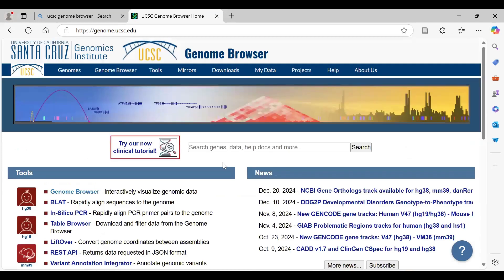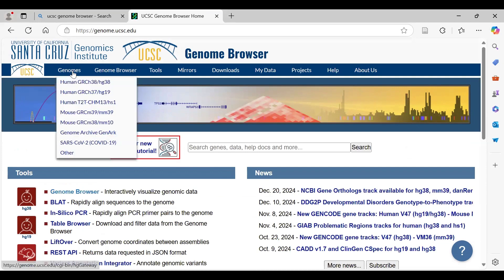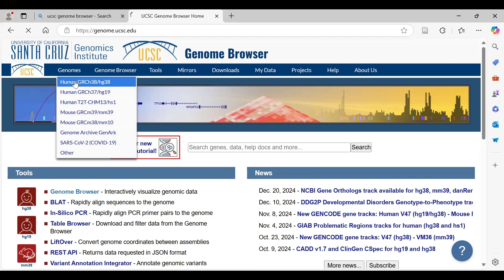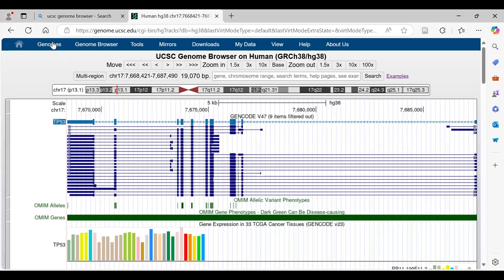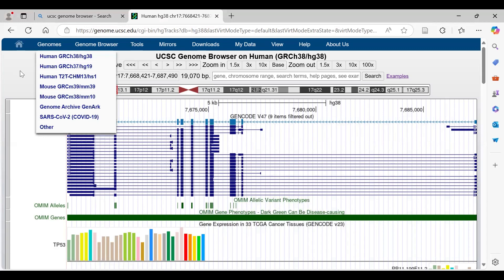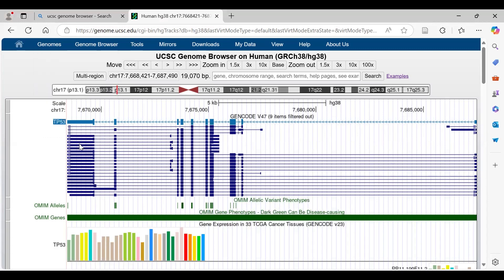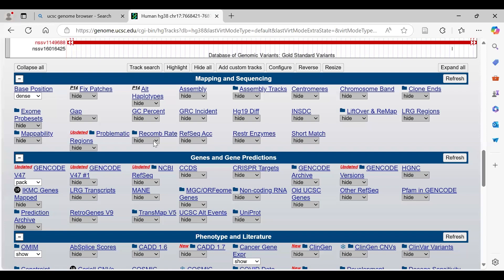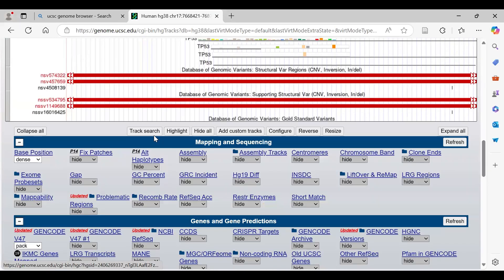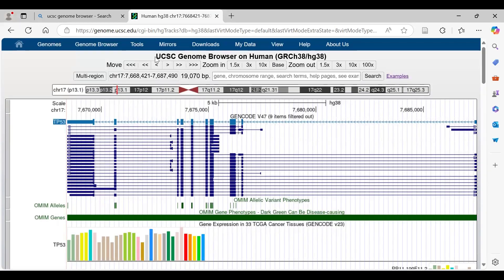Now let's move to the query part for a quick hands-on. The first thing is we have to select the assembly. Since we are interested in working with the human genome, I've clicked on Genomes and selected the human genome, and you can see the page opens up like this.